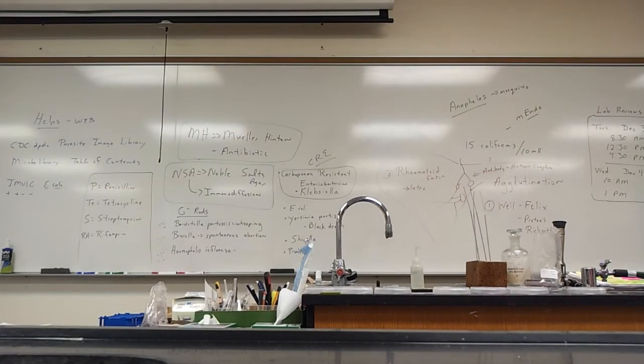For an antiseptic, and I would have to label Lysol or disinfectant. For a disinfectant, I have to label it. Let's talk antiseptics. This one has Scope, it has Listerine, and it has, what's that? That's the hand sanitizer. Okay, it worked.